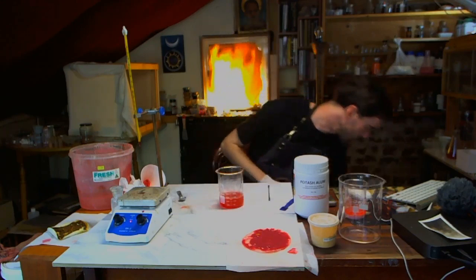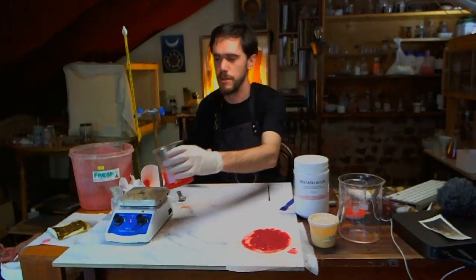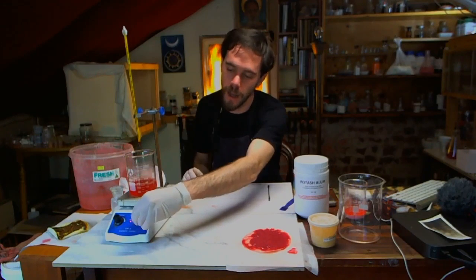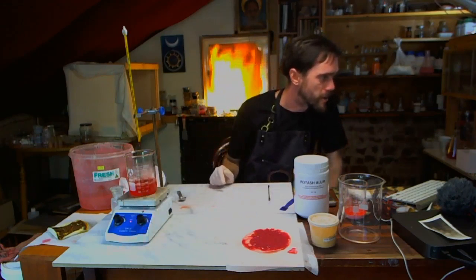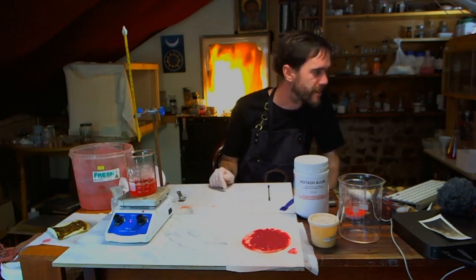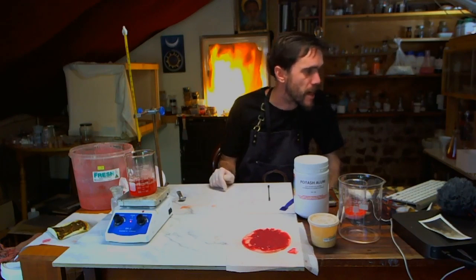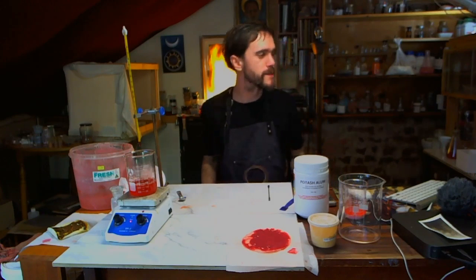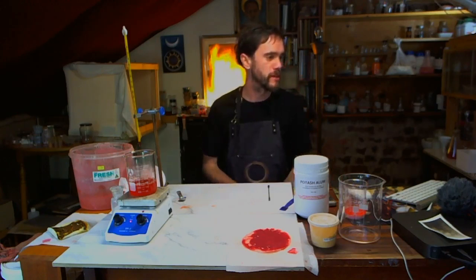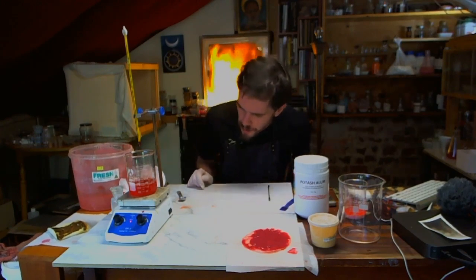So, what the next step of this process says to do is to take the liquid and boil it. It says, take the deep red liquid that is removed from the lead sulfate deposit. The entire red solution is now heated to boiling until a purple-red sediment separates from the boiling solution. So it's brought to boiling, but not boiled.